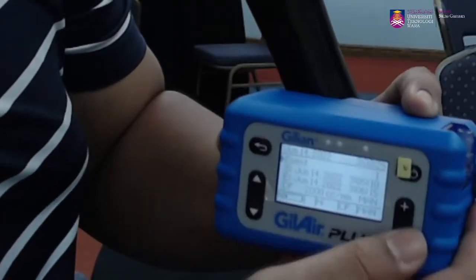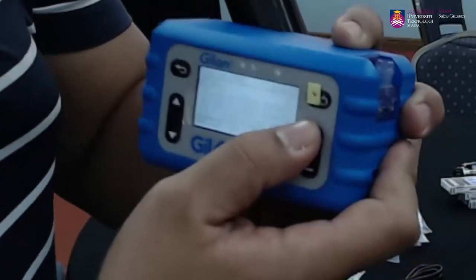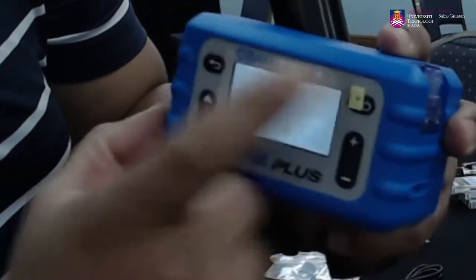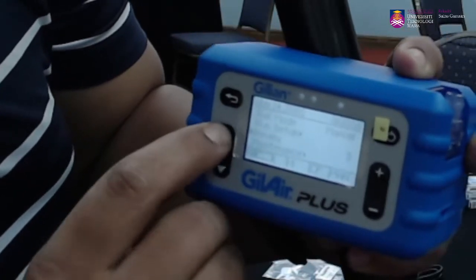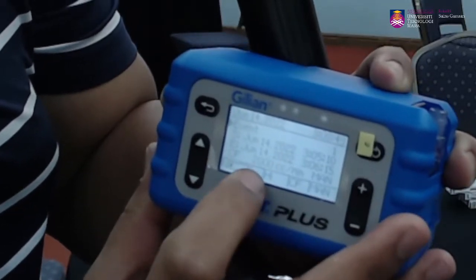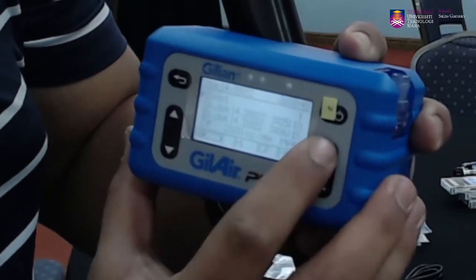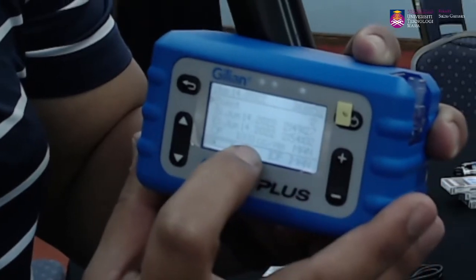Macam tadilah saya dah go through daripada setting ni, kita select kat bahagian review. Okay, so daripada sini event 1. So ini yang tadi kita buat lah, 2000 cc per minute tadi tu. Kalau kita nak go through, kita just tekan tambah. So dia akan keluar kepada event 2 yang tadi tu, 1000 cc per minute.